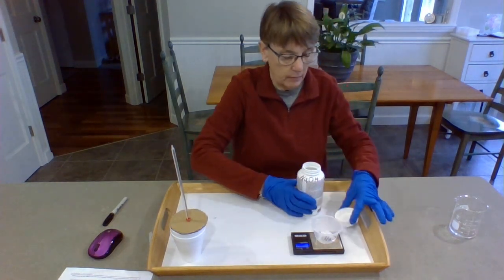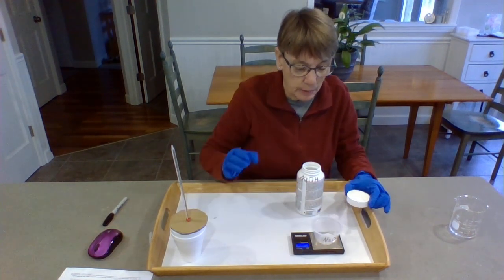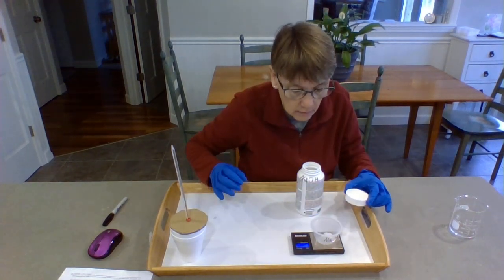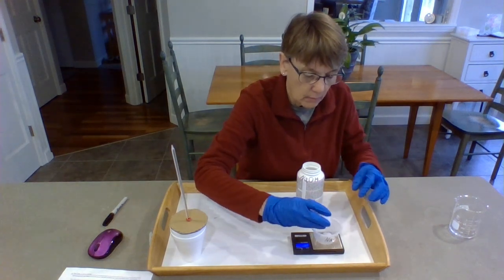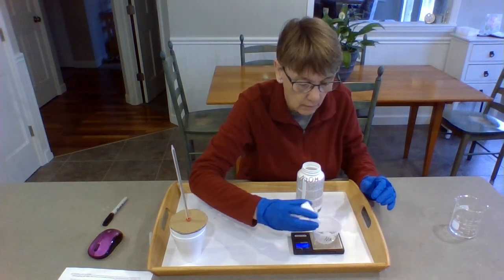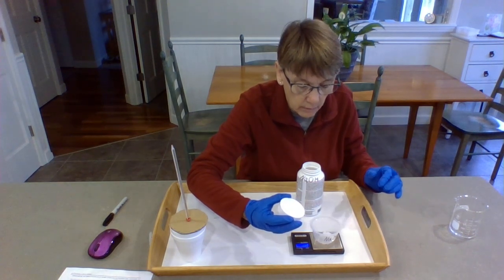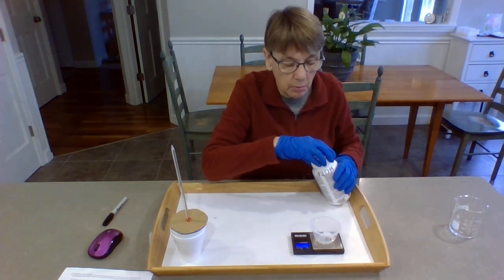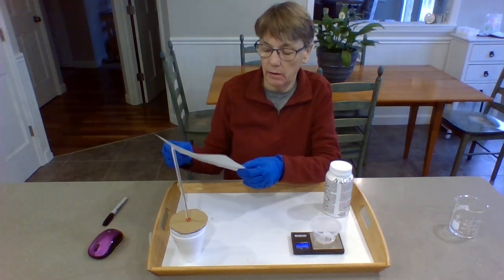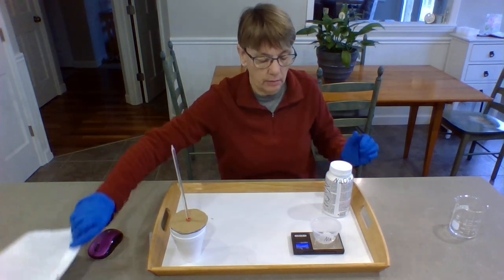Oops, I got too much. So I'm going to pour some out. I'm not going to pour it directly into the container, I'm going to put it in the lid. Okay, 2.8 grams. So that's the quantity of sodium hydroxide we're starting with. That's step 7.